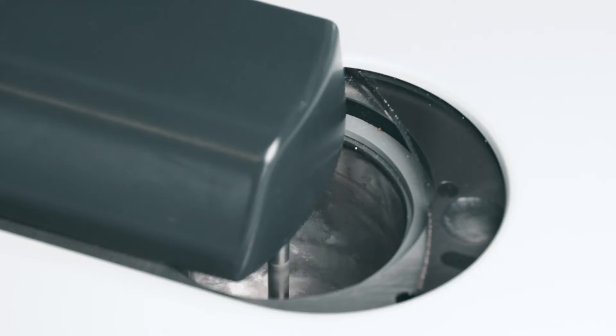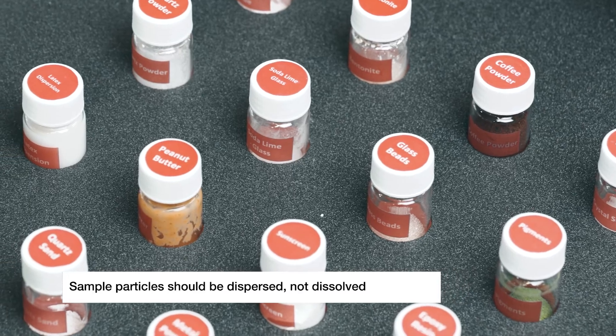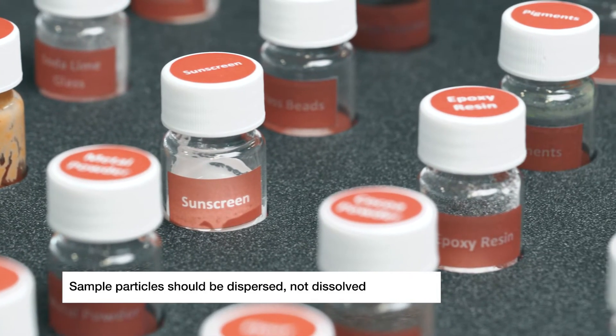Either way, the particles that are to be measured within the sample must stay intact in the carrier liquid. In other words, the sample needs to be dispersed in the carrier liquid and not dissolved.